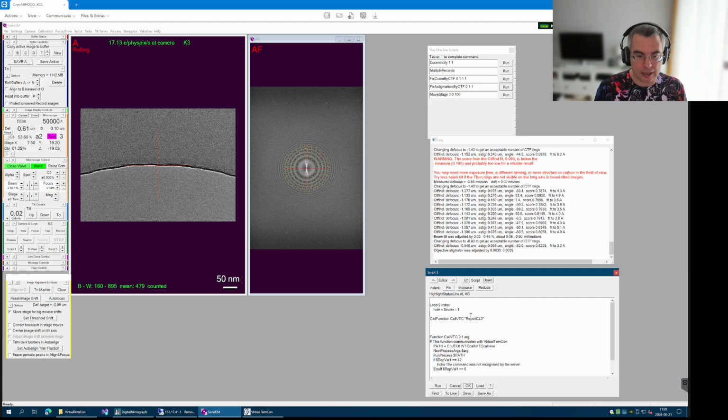And then we can say call function, call VTC, and we may want to say set hole $hole, and maybe take a record picture. So something that simple. And we end loop. And let me run the script and let's see what happens.